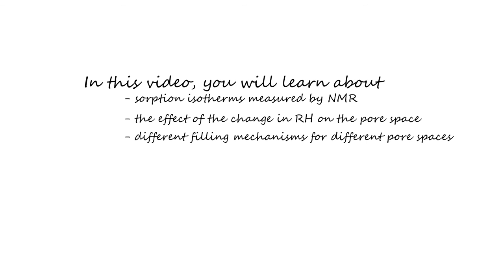In this video, we will learn about how a sorption isotherm can be measured by NMR, how the effects of the changes in relative humidity on the pore space can be quantified, and we will learn about different filling mechanisms of pores during drying and rewetting of cement.